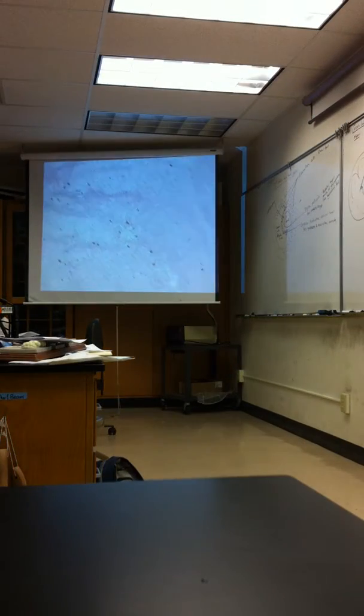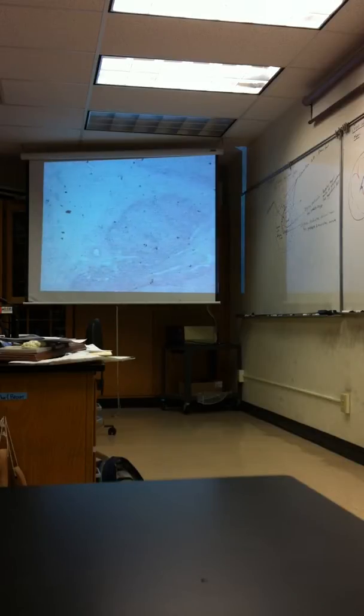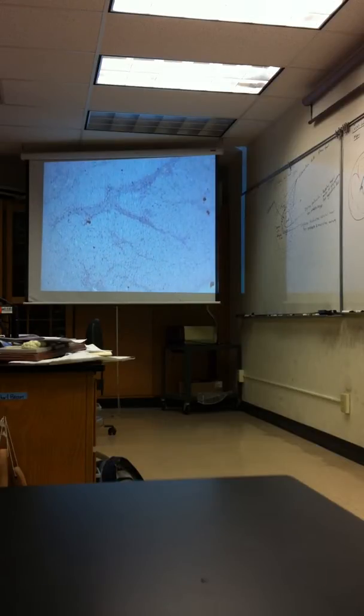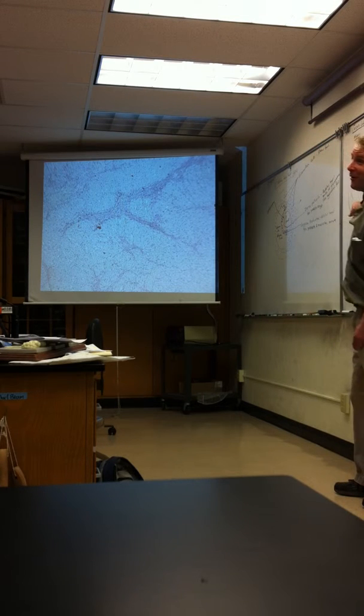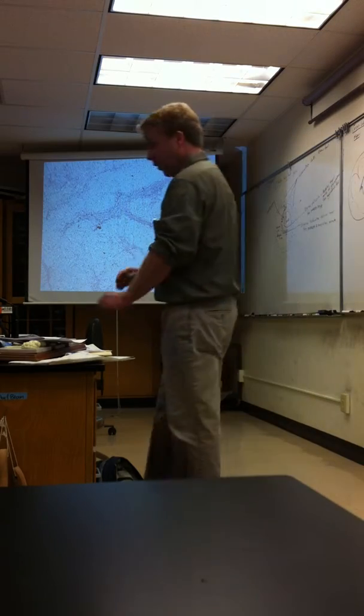And then I can see right here this huge structure that looks kind of fluffy. Looks a little bit like cotton candy. That's the way I kind of think of it. Is the corpus luteum. And so that's a good place right there to see the corpus luteum. It is a hard one to draw. So you can see my picture, kind of hard to draw. But this was trying to draw that. But that is the corpus luteum.